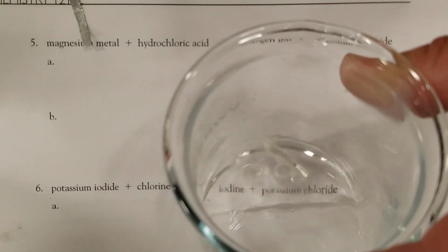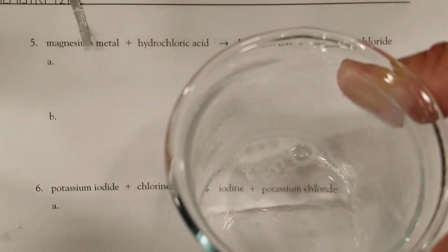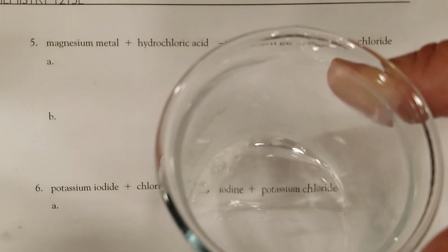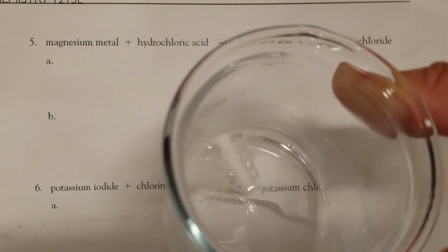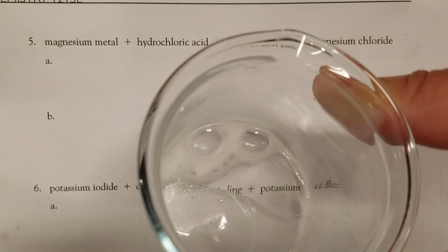And here's our strips of magnesium metal. And you can see it bubbling and fizzing. And those bubbles are bubbles of hydrogen gas. That's what we're making there, is the hydrogen gas. So the magnesium metal and hydrochloric acid, and in a very short time there will be no magnesium metal left.